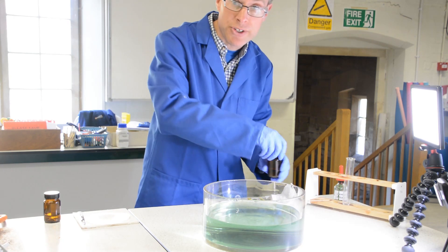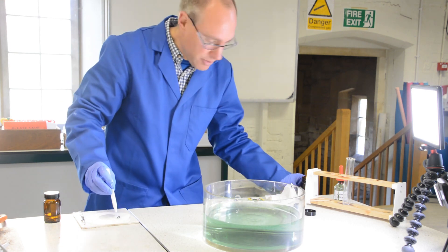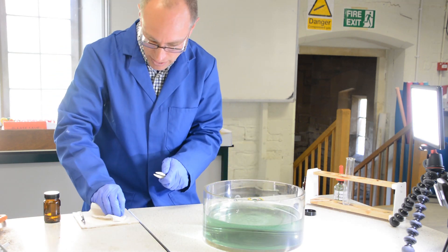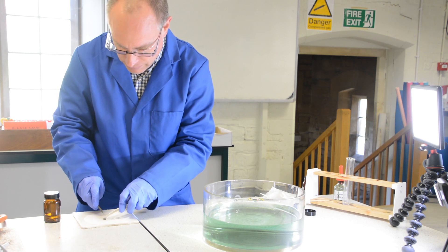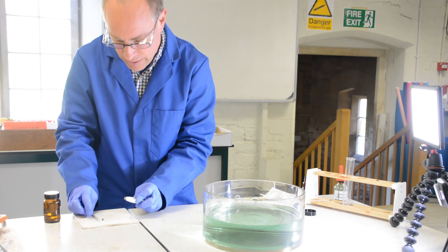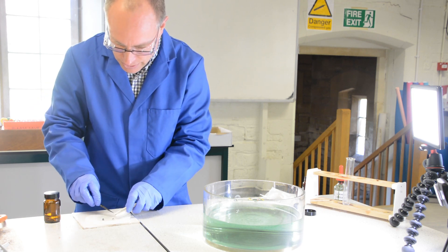The first alkali metal I'm going to react, building up a series of reactivity in reverse order, is some lithium. I'll just cut myself a piece of lithium. Again, it's covered in oil. Just cut that piece.